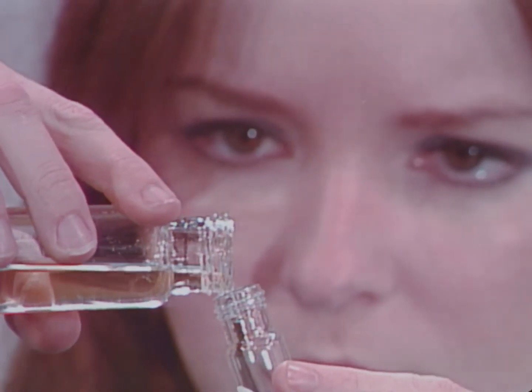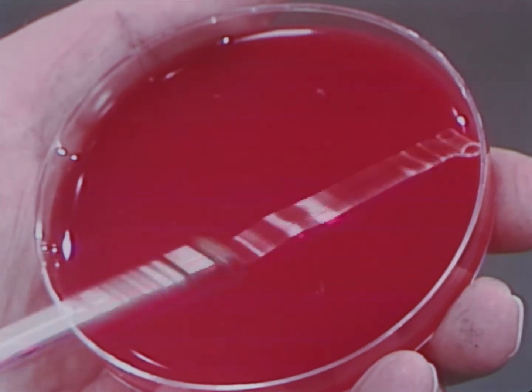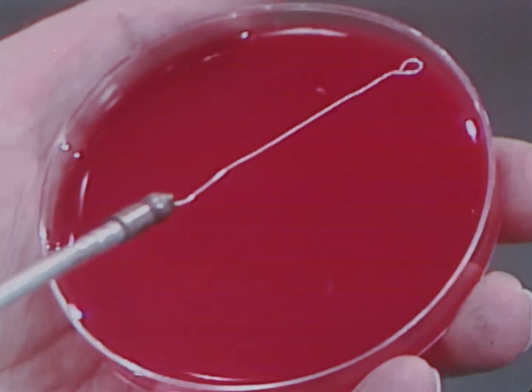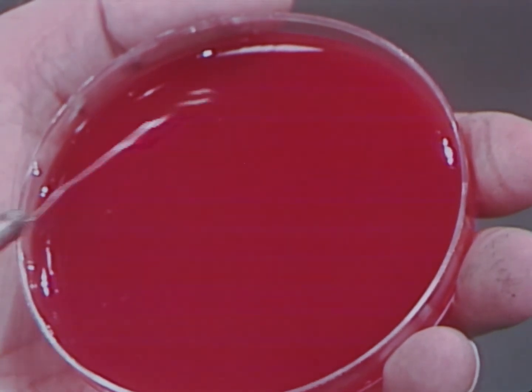During this presentation, we have explored ways to reduce infectious aerosols in the laboratory. We have seen how large droplets and droplet nuclei aerosols are formed in common laboratory procedures and may result in contamination.